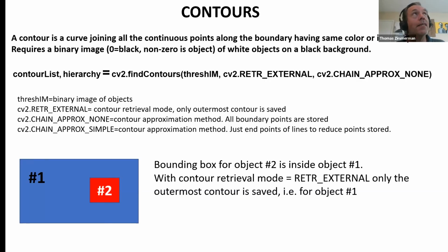And honestly, we've never had to do it, because we always want the silhouette to capture the shape of the creature, to do the classification. But I know organelles are really important to biologists, so I thought I'd just tell you it's available for you when you need it.